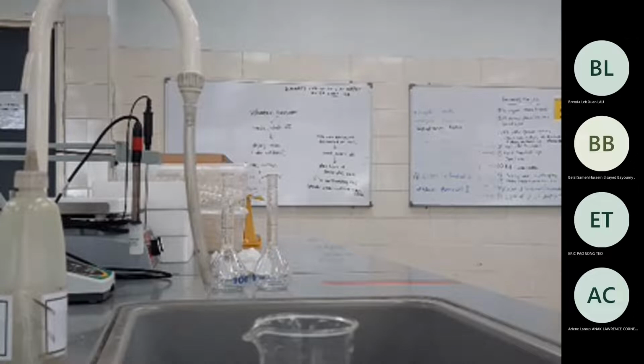Not a small beaker. We'll be taking the 100 milliliter beaker, should be okay, or a 50 milliliter beaker will also be okay. Yeah, rinse it with water, distilled water.